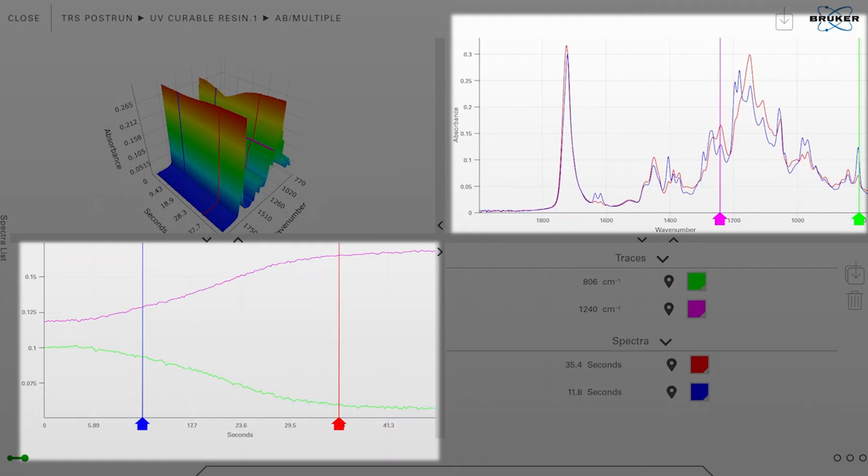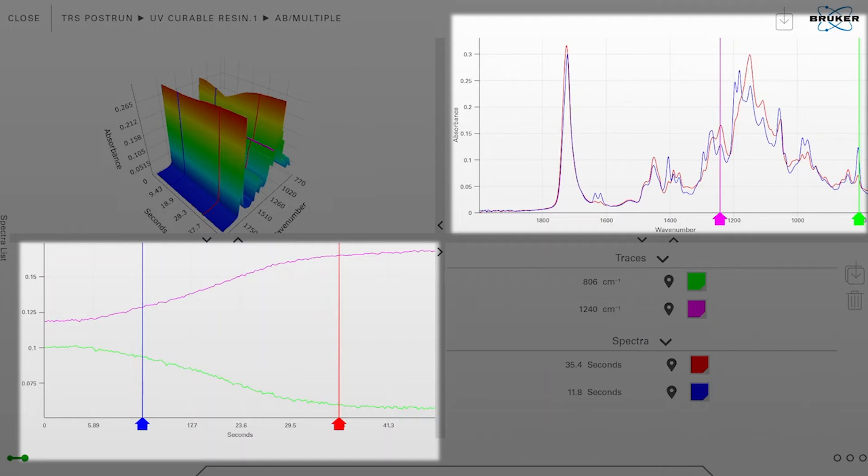As you now can see in the lower left corner, the bands with the pink marker are increasing in intensity over time and the band which I have located the green marker on is decreasing over time.